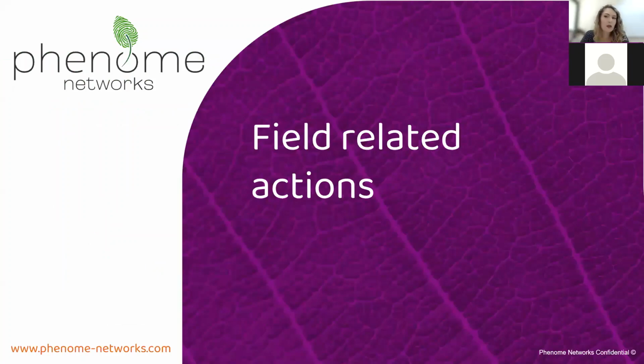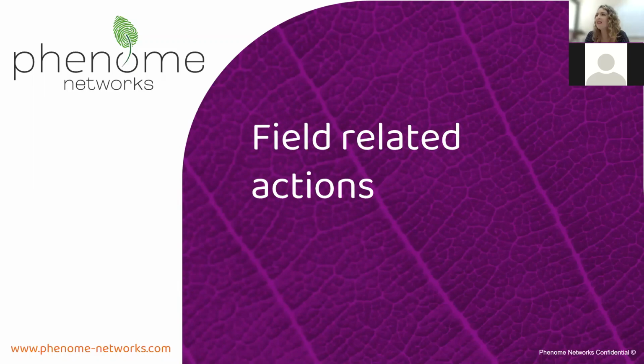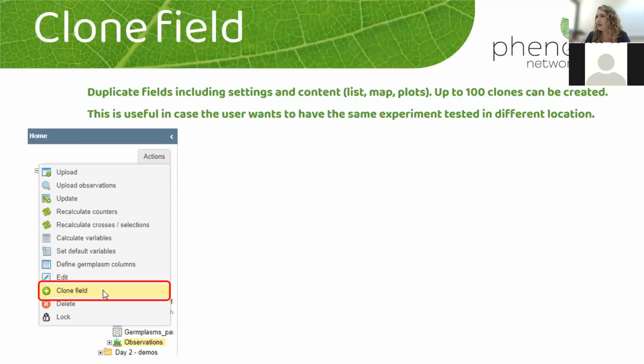Now we're moving to field-related actions. We will start with clone field. Clone field will allow you to duplicate a field, including all of the settings and the content: the list, the map, the plots. We can clone up to 100 fields. This is useful in case the user wants to have the same experiment with the same germplasm, the same map, the same plot names, just in different locations.